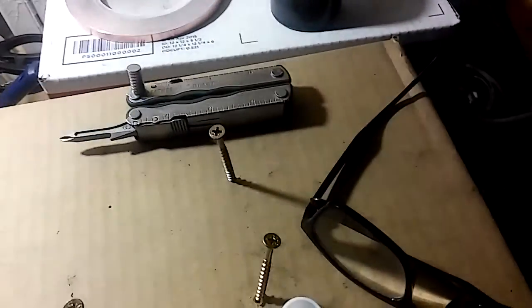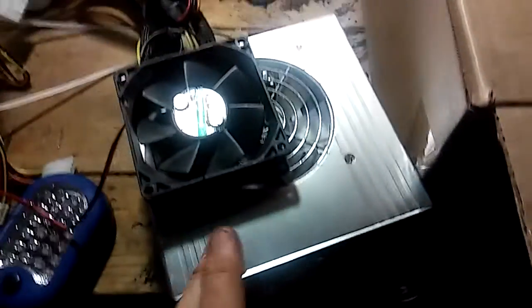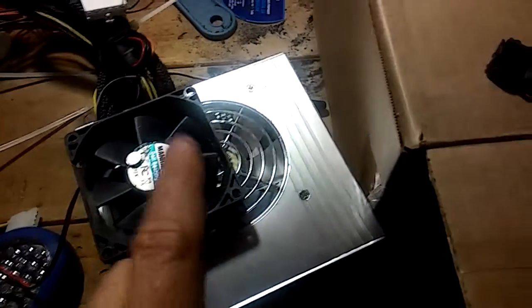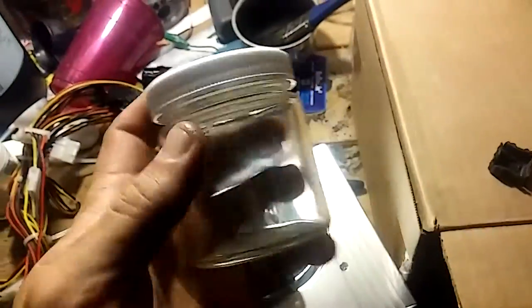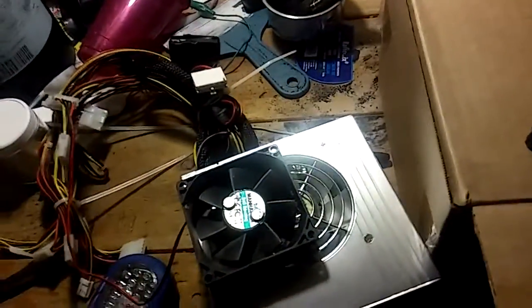I'm making a magnetic stirrer out of this box, this power supply, and this fan, because I need to be able to stir the liquid inside for a couple hours in order to mix my material with the binder.